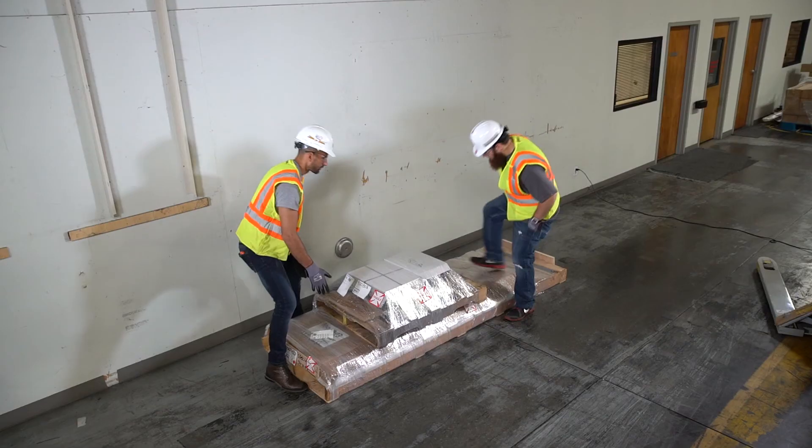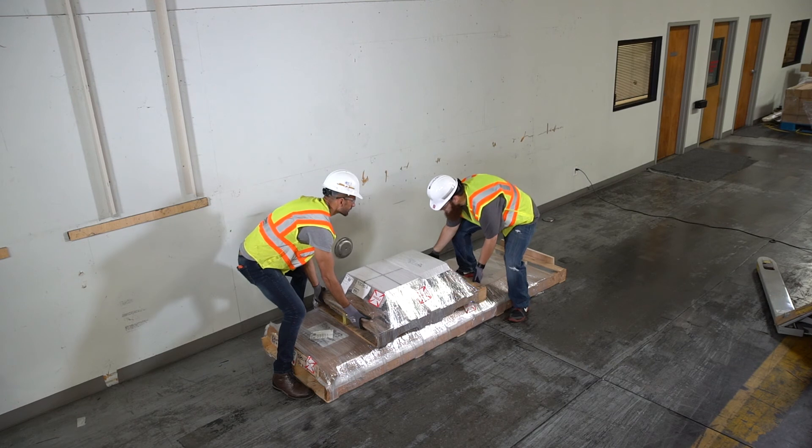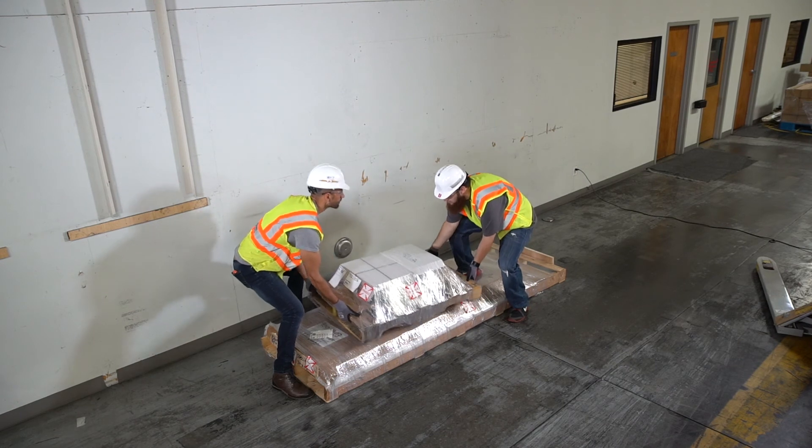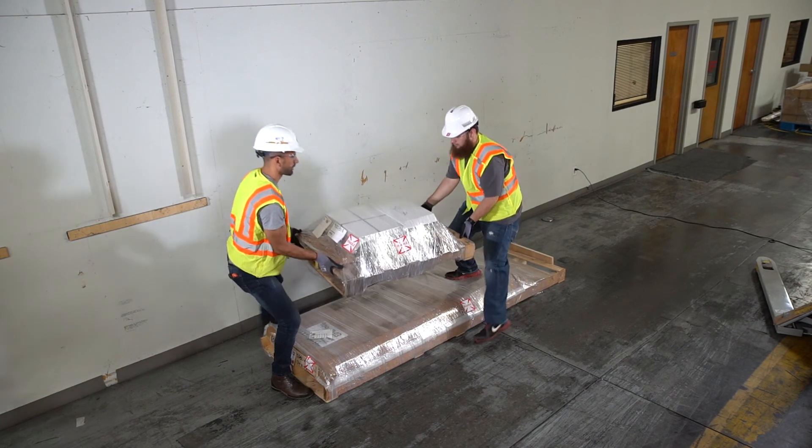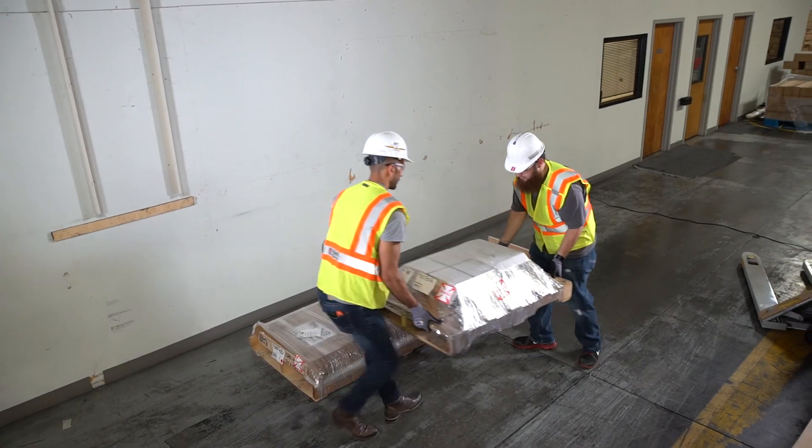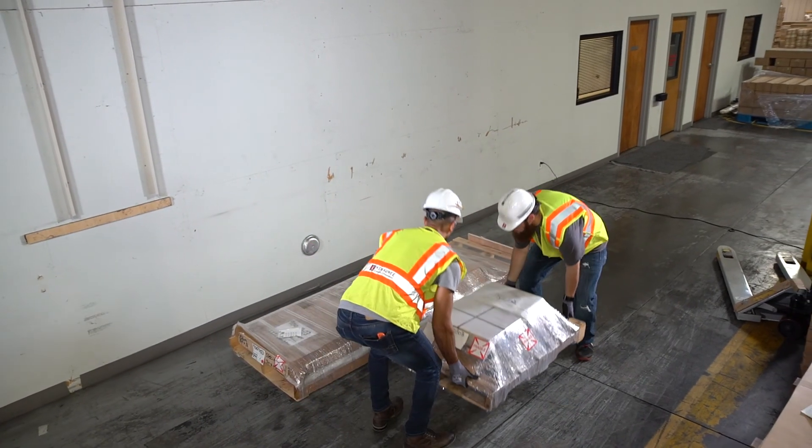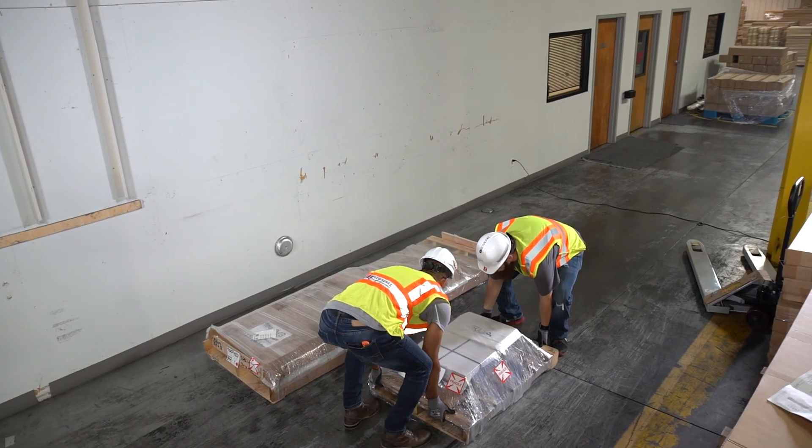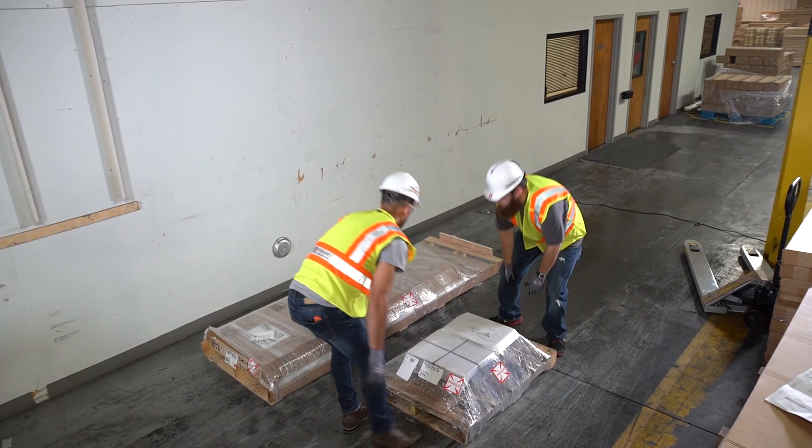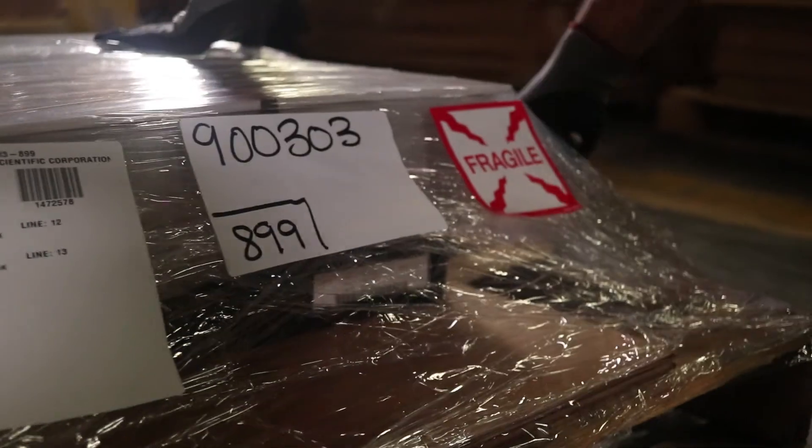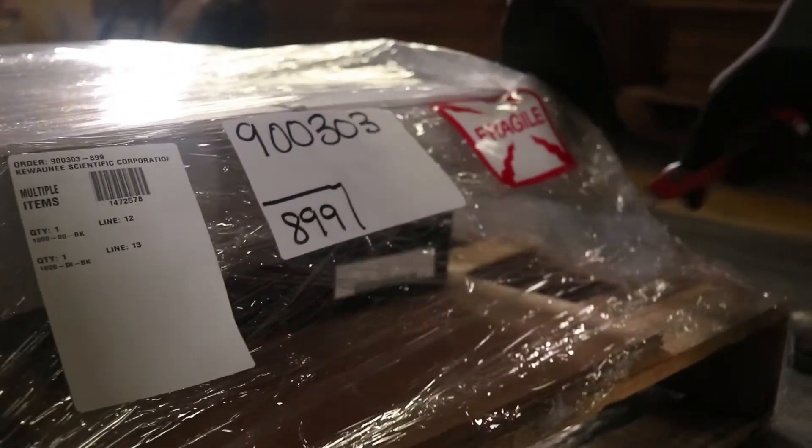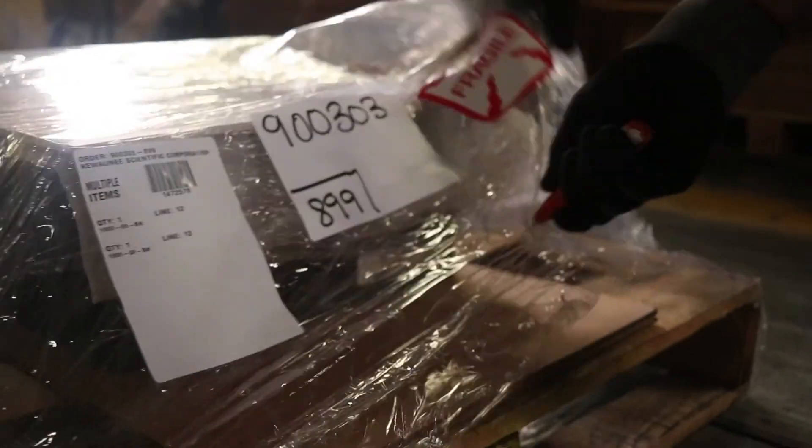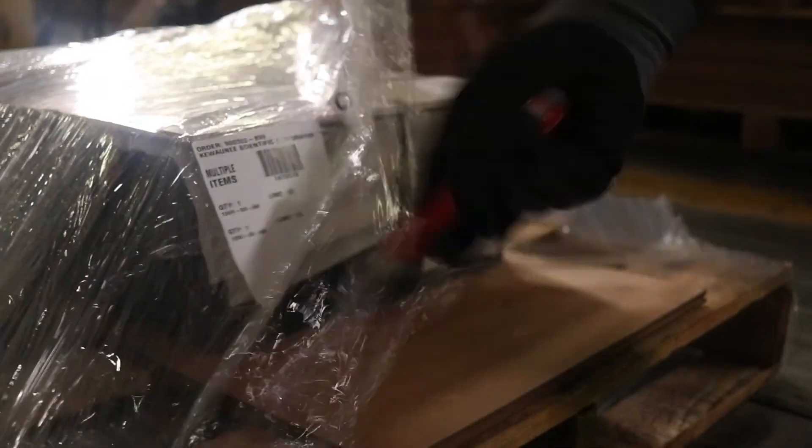If work tops are being stored, they should never be stored on their side and should always be stored on a flat surface with protection between each top to prevent warping or sagging.